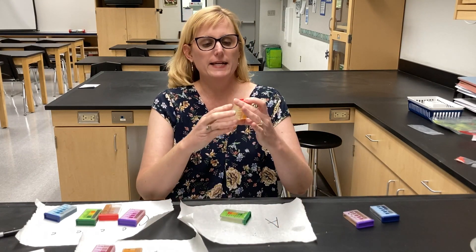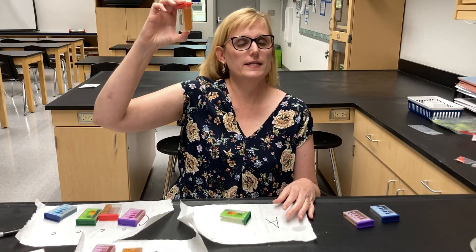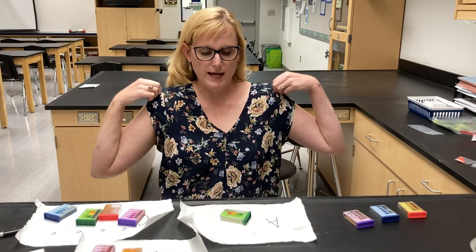And then we have phosphorus — hold that up to the light, it looks to me like it's sufficient. So write that down for phosphorus for sample A.